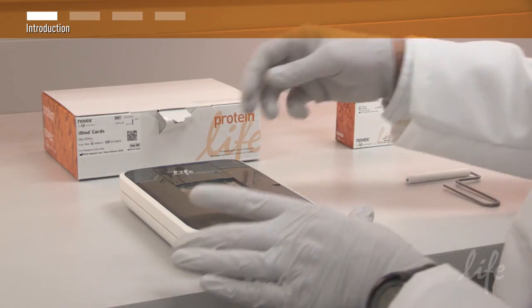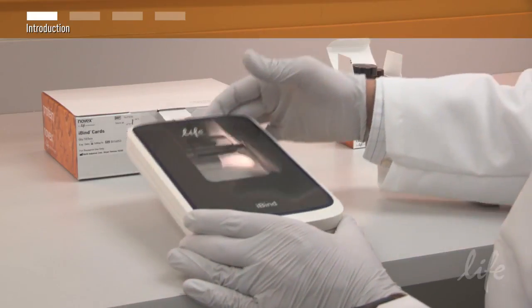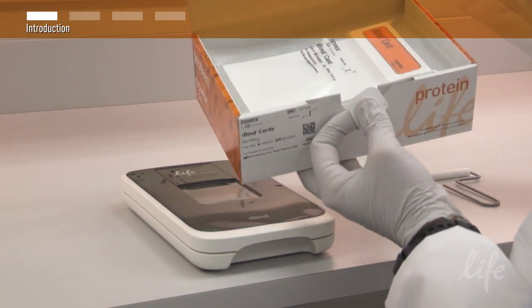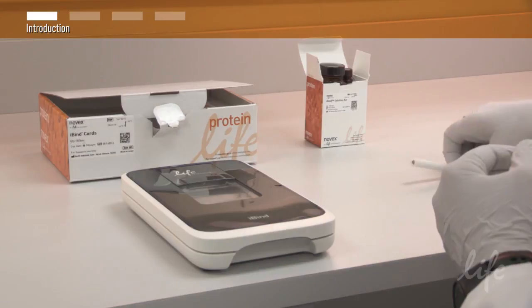The iBind Western system comes with an iBind device, iBind cards, an iBind solution kit, and a roller.